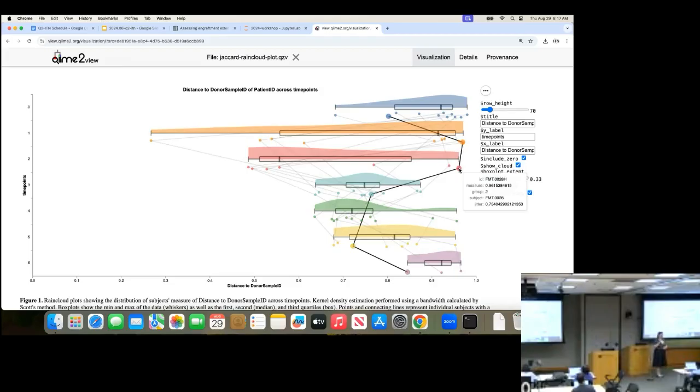So I would say that time point 3 is probably our biggest change in time, but it also is our least informative moment for me as a person looking at FMT engraftment, because in that moment I'm not sure what has engrafted and what we're just sampling because we gave them an FMT, right? I'm not quite sure what is engrafting and staying around or what we're just capturing because they had the FMT 2 days prior. Does that make sense?